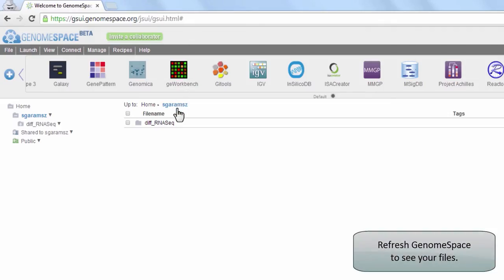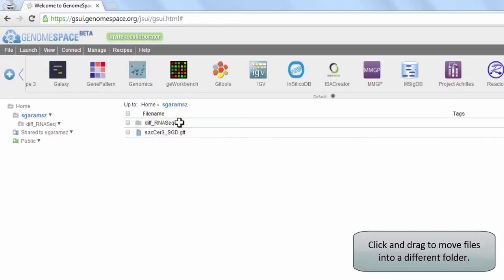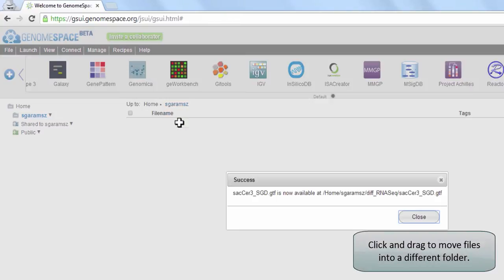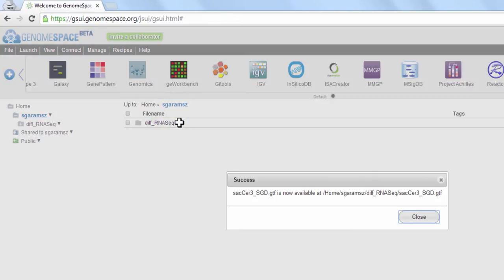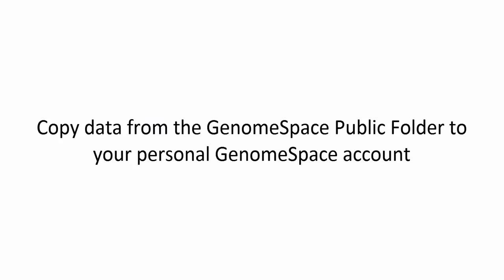We now return to GenomeSpace and refresh the page to view our file in our top user folder. Feel free to move the file to any folder you desire by clicking and dragging.